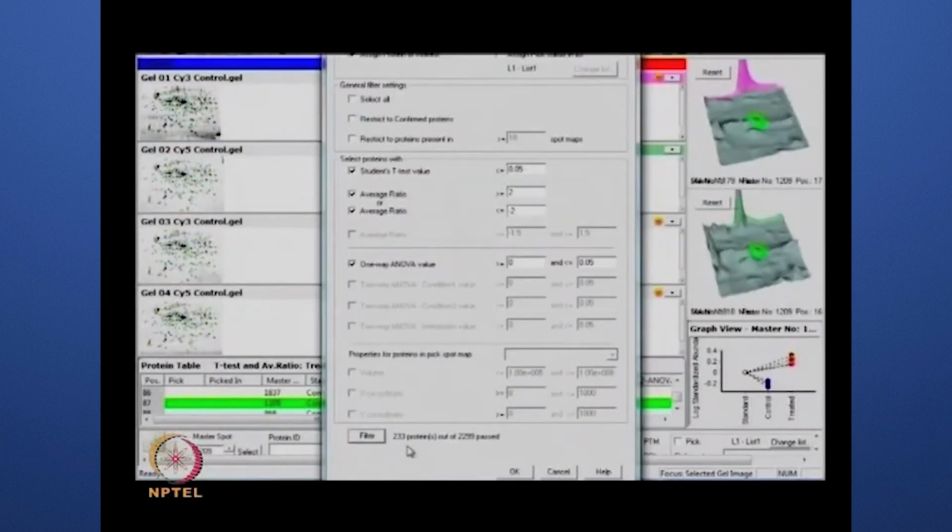So, can you elaborate on what EDA, or extended data analysis, is, what it can do, which we are unable to do in BVA? So, there are layers here, right? One is the DIA followed by BVA, and then ultimately EDA analysis.